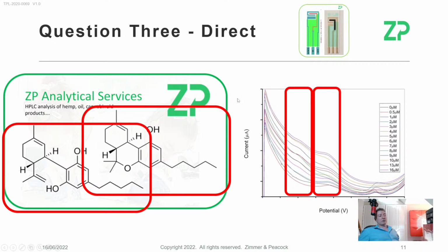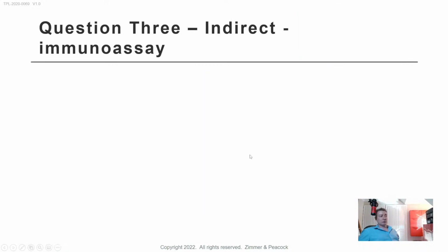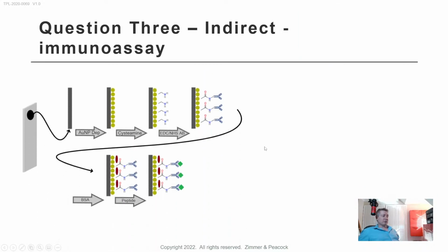So I say here direct, so we can directly detect these molecules. And we've also done a bit of indirect detection. This is the scheme that we used. You take a carbon electrode with gold nanoparticles, and then you tether on a thiol, and from the thiol you can form a bond with a macromolecule, and it's the macromolecule that has specificity to the CBD and the THC.